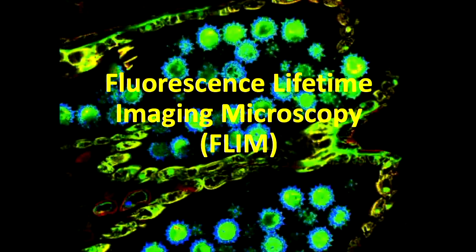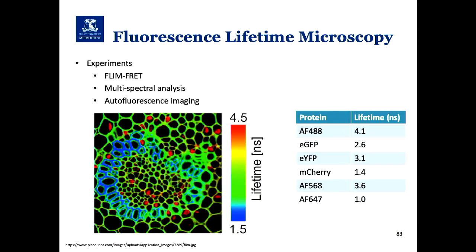So fluorescence lifetime imaging microscopy, or FLIM. As I mentioned, you can use it for what we call FLIM-FRET analysis. One of the key things with fluorescence lifetime imaging microscopy is normally when we're doing fluorescence microscopy, we're collecting emission over a specific set of wavelengths. So we've set a bandpass filter or a range that we're collecting fluorescence over. With fluorescence lifetime, we're not worrying about what the wavelength of the light is. We're looking at the lifetime.